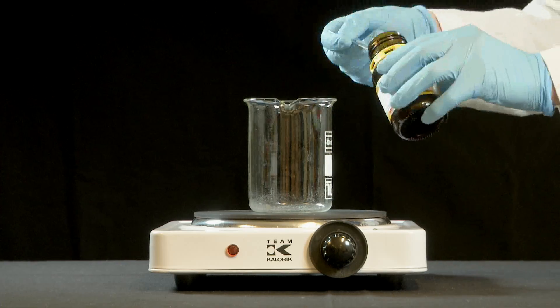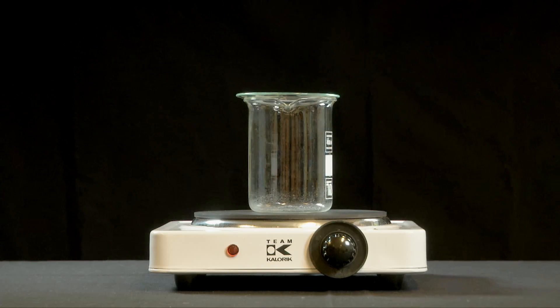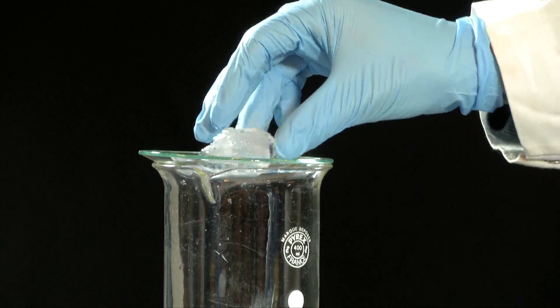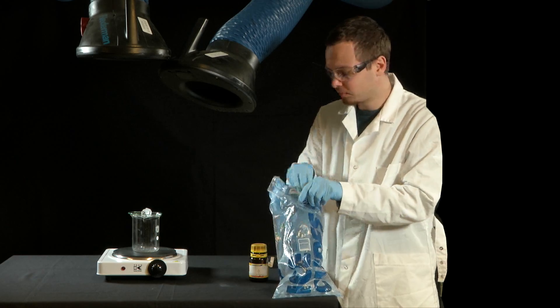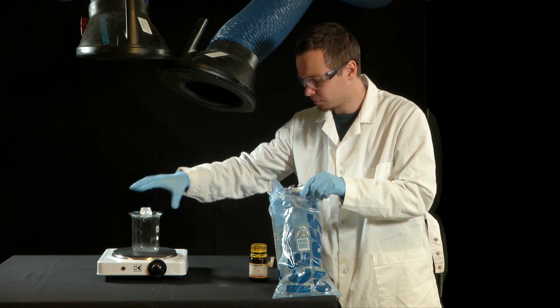We put just a few teaspoons of solid iodine into the beaker. The watch glass then goes on top of the beaker and we place some ice cubes onto the watch glass in order to keep it cold.